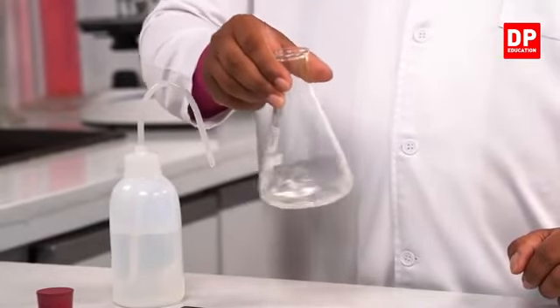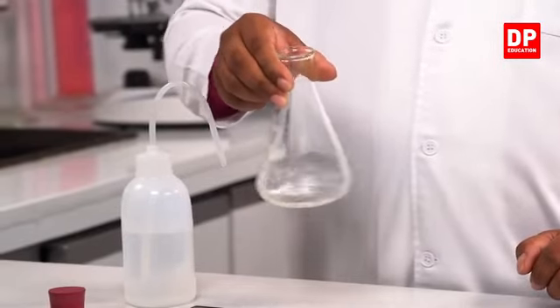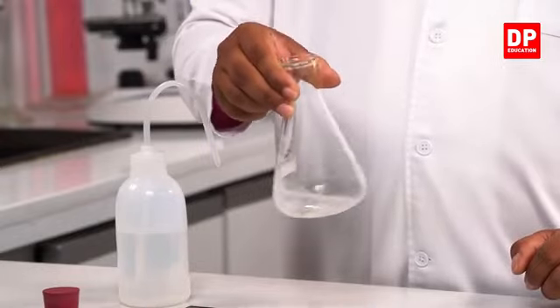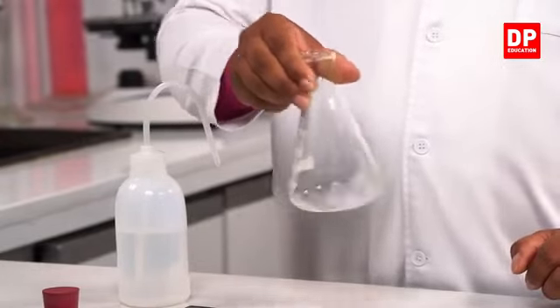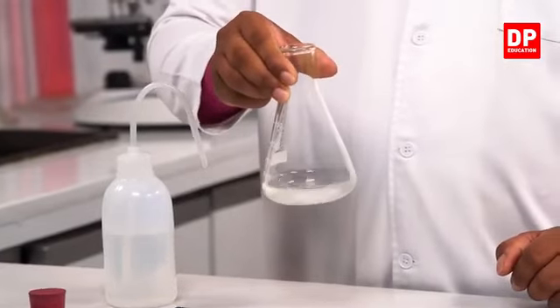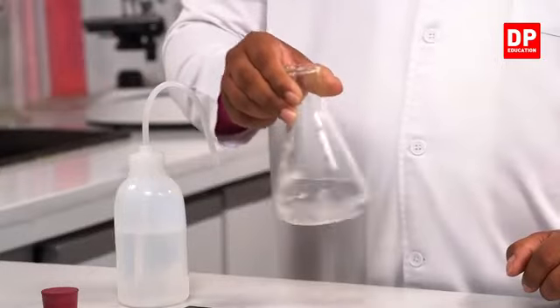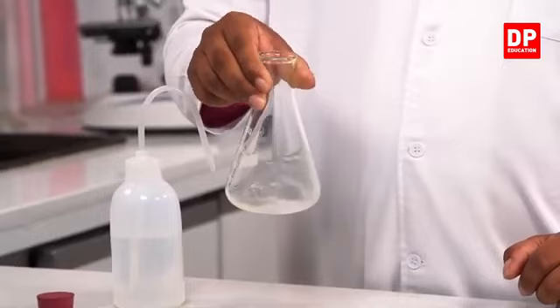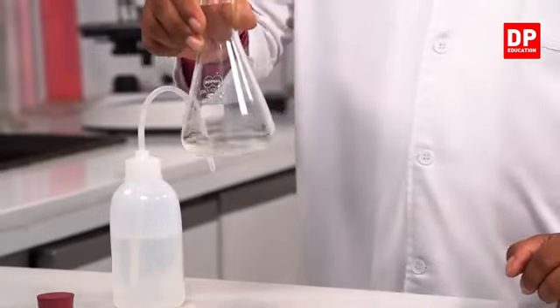You have to dissolve it very well inside this container. So we'll dissolve it. So I have dissolved lead nitrate in this flask using water, and I've made a lead nitrate solution here.